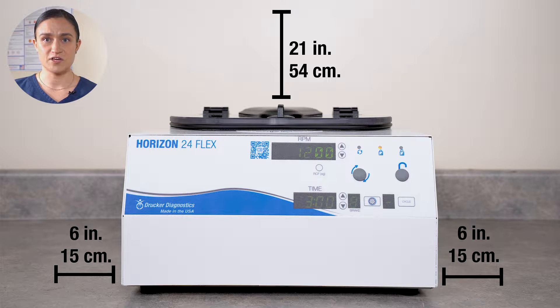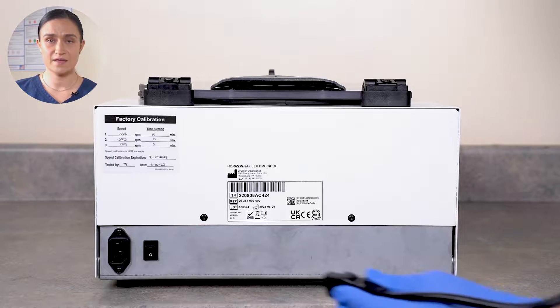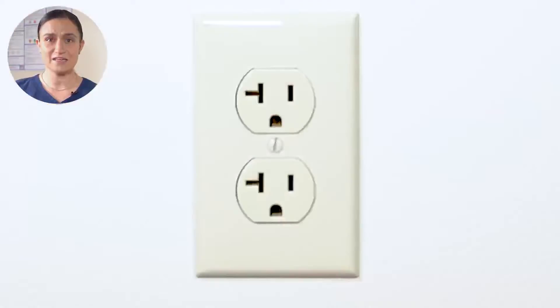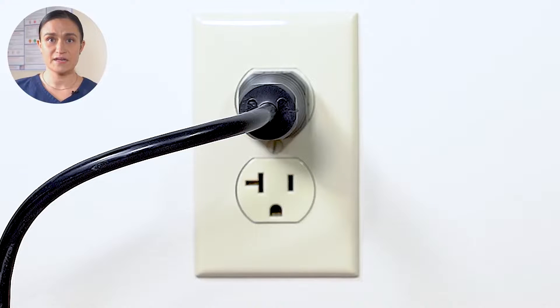Start by placing the centrifuge on a flat, level, sturdy surface. Leave at least 6 inches or 15 centimeters of space on all sides and at least 21 inches or 54 centimeters of height above the lid so you can easily open it. Locate the power cord included in the accessories box, plug it into the back of your centrifuge and then into the wall. Make sure your outlet is easily accessible so you can unplug your centrifuge for cleaning and maintenance.